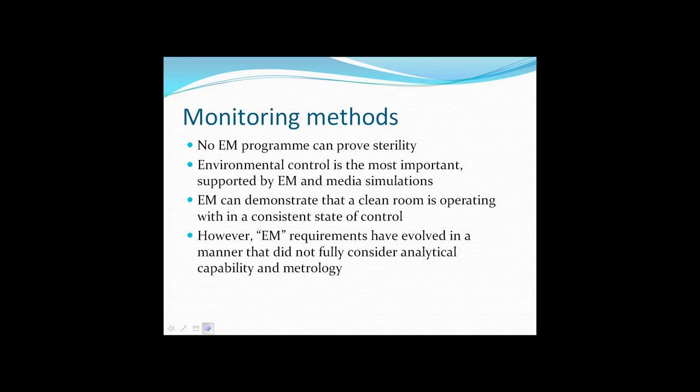It discusses the value of media fill simulations, and that provides a valuable layer of confidence about the aseptic process, and emphasises that environmental monitoring really is this sort of check of how well controls are going.